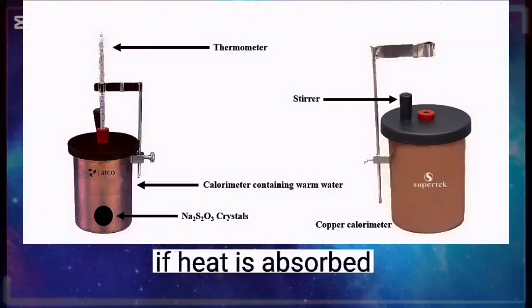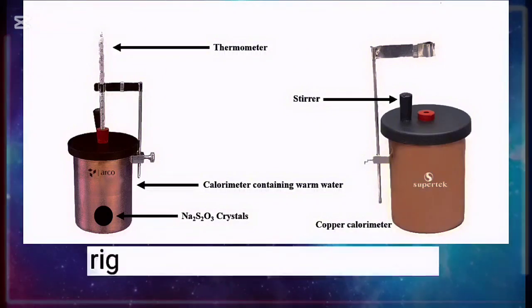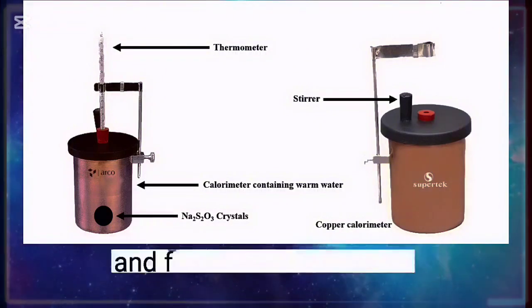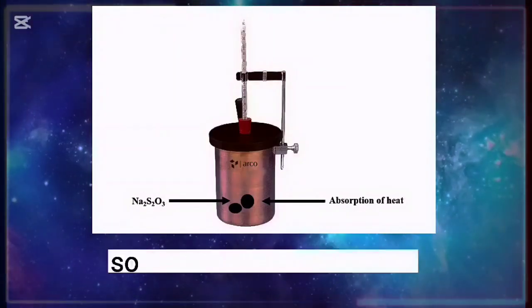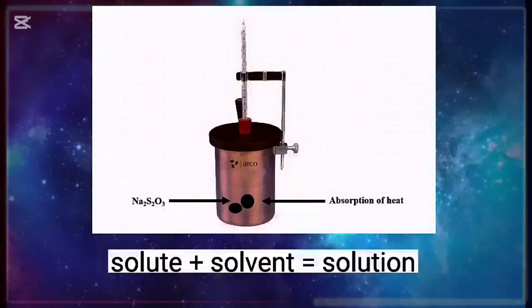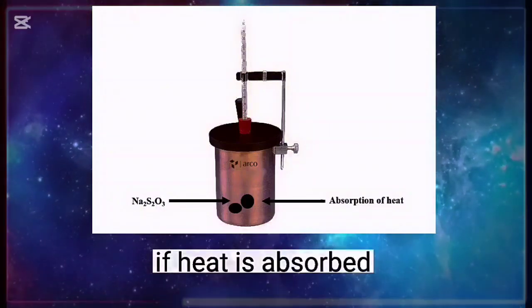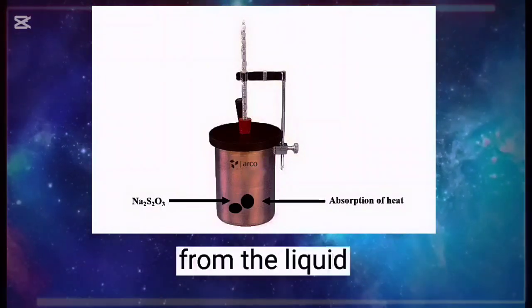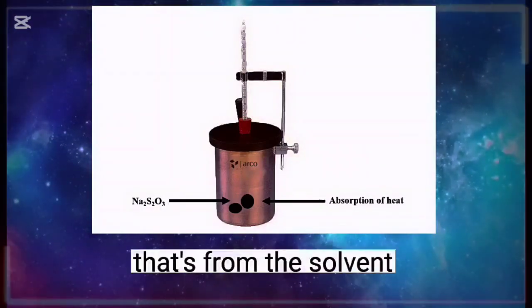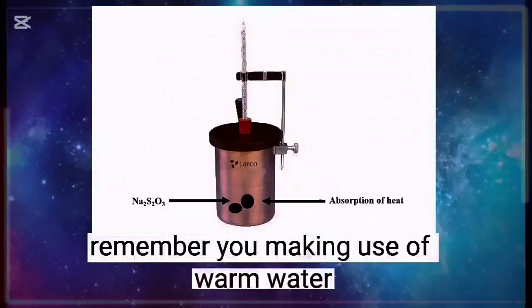In the same way, if heat is absorbed, because essentially in this experiment, heat is going to be absorbed, it's a dissolution process, and for a solid to dissolve and become a solution, solute plus solvent gives you solution. So if heat is absorbed, the heat energy is transferred from the liquid, that's from the solvent. Remember, you're making use of warm water.